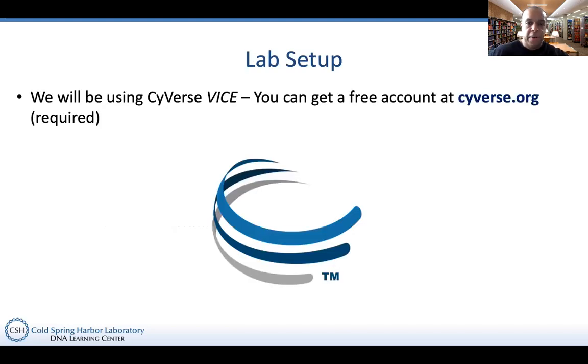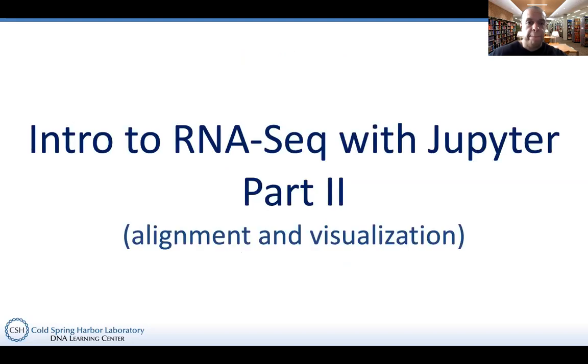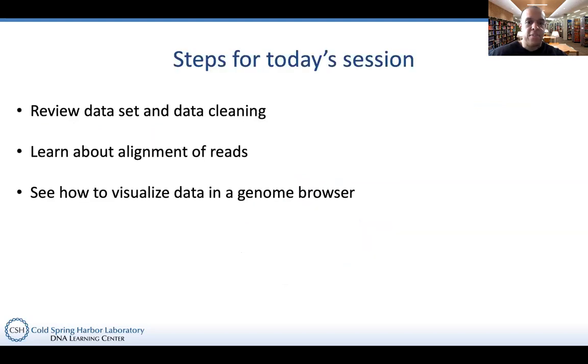As I mentioned, we're going to be using a tool through Cyverse. So if you go to cyverse.org, you can sign up for a free account. It is required. You can do everything that I'm doing, but you will need the Cyverse account, and it is free. So we're going to focus on alignment and visualization today, and let's go ahead and get ourselves grounded.